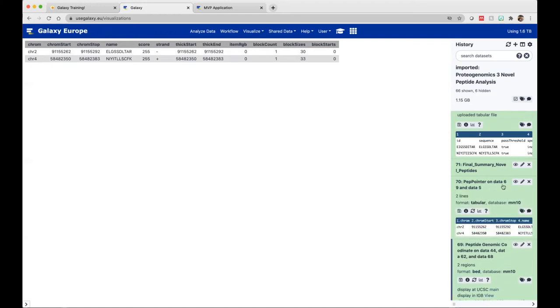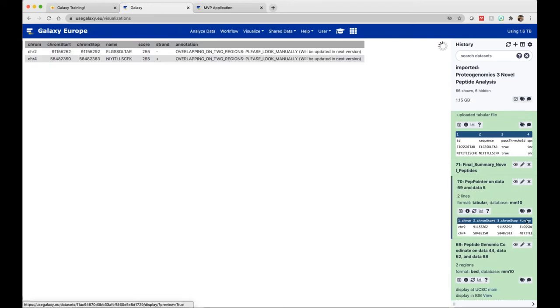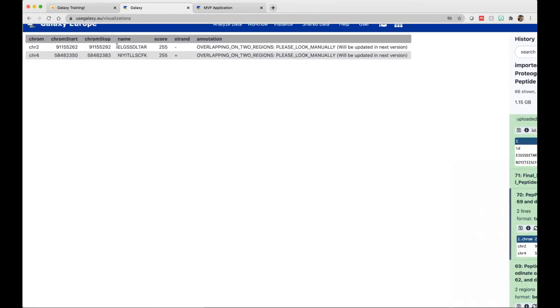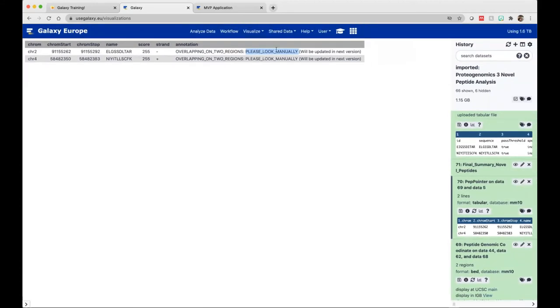Now we have more information regarding the peptide. If I click on the PepPointer tool output, it gives me information regarding the peptide again with its annotation. It's telling me that the peptide ELGSSTLTAR is on chromosome two and it's overlapping on two regions, but it wants us to look manually — by looking manually, it means using the MVP's IGV browser. We will be updating this in the next version so it will tell you every detail about the peptide.